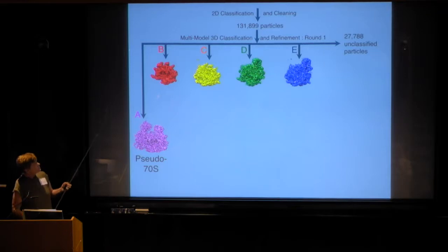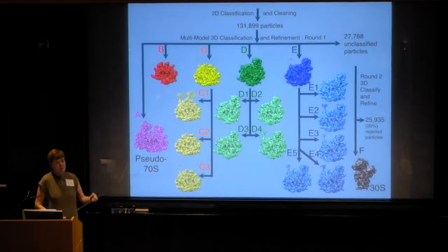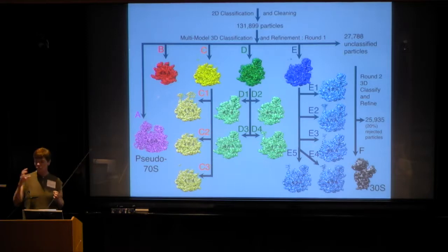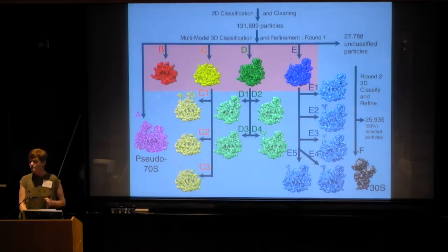And in this case, by doing the sorting and classifying, it was found eventually that there were at least 14 different conformational states of these intermediate ribosomes. So these ribosomes that were half-formed, and that's what we wanted to see, because that would tell us what that formation pathway was. But there were tons of problems in doing this, because how do we know there's 14? Maybe there's 1,400, maybe there's 14, maybe some of them could come together. Do we really know what pathway they're on?